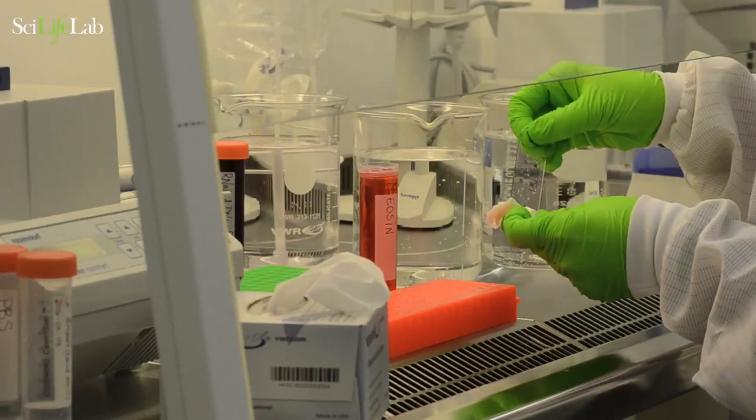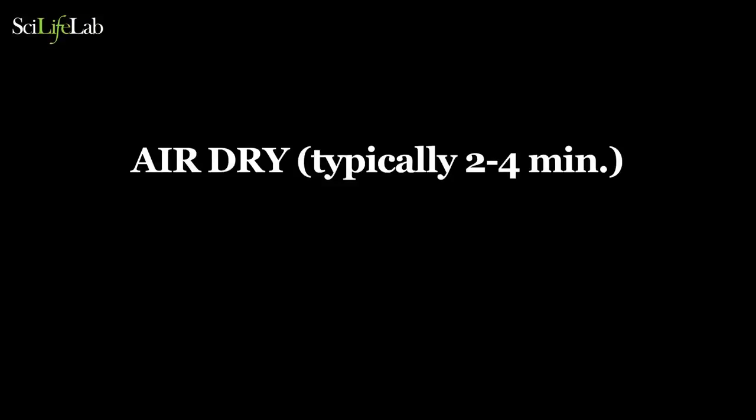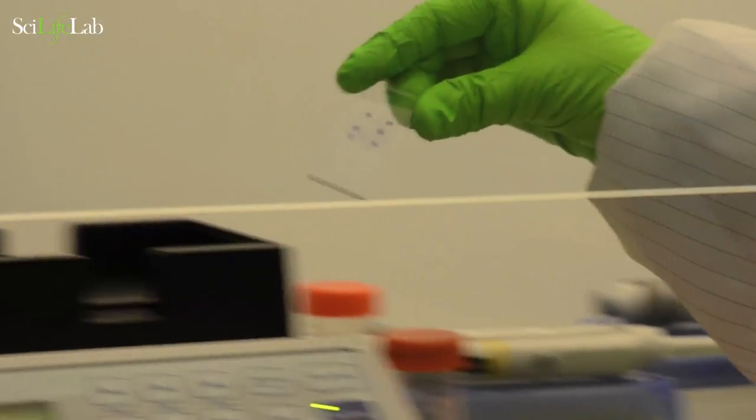Carefully dry the edges and the back of the glass slide and allow to dry at room temperature. Check that no water remains on the tissue before heating, then incubate at 37 degrees for 5 minutes.